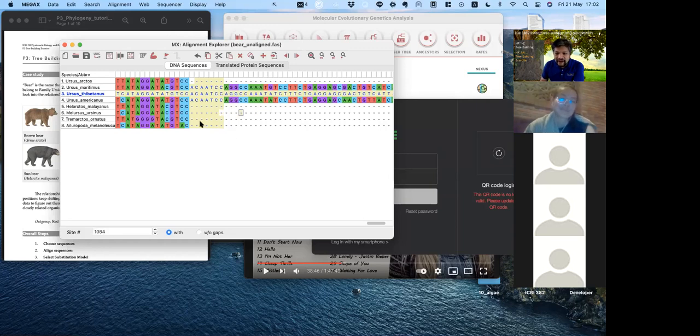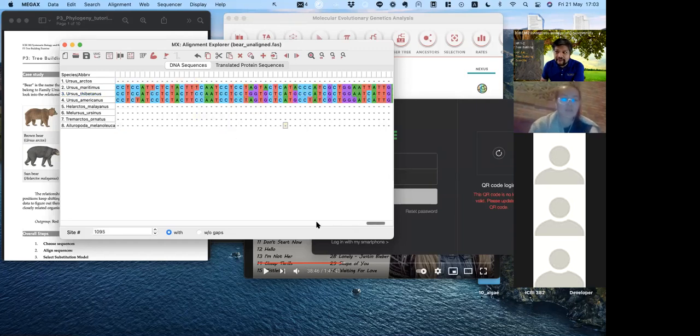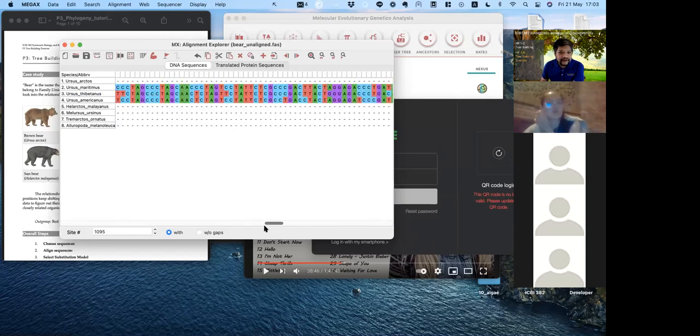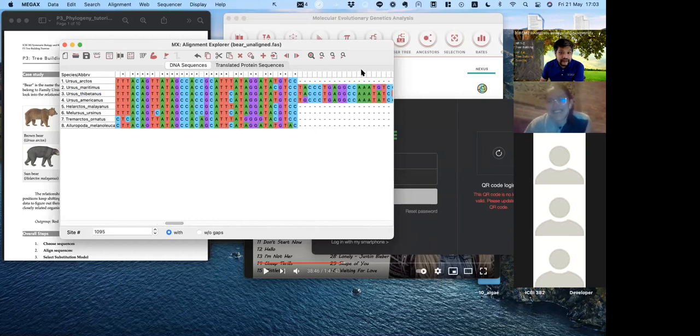Okay, so once you have the right alignment, which is all kind of messed up for me right now. Good God. Did that delete for me or did it not? Okay. Oh God. All right.